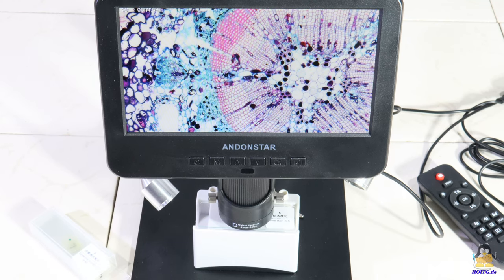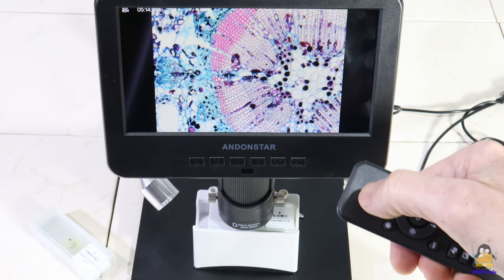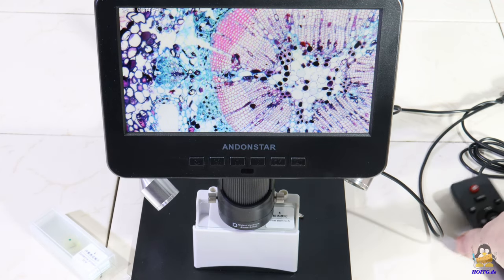With the remote control you don't have to touch the microscope when triggering photos or video sequences. With that you can take well focused shots.